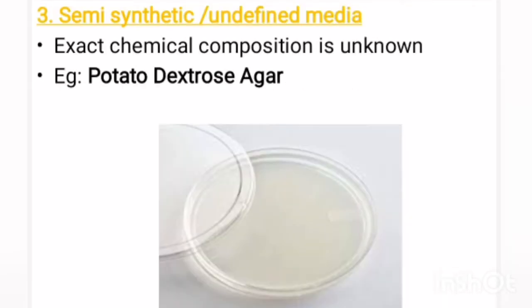Third type, semi-synthetic or undefined media. An example for the semi-synthetic media is potato dextrose agar. It is a media where the exact chemical composition is unknown.